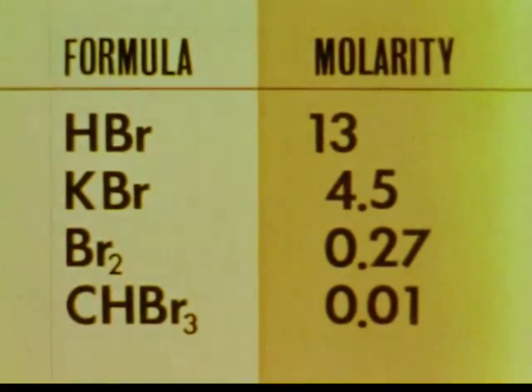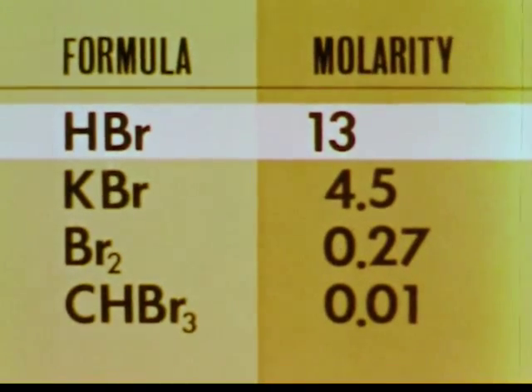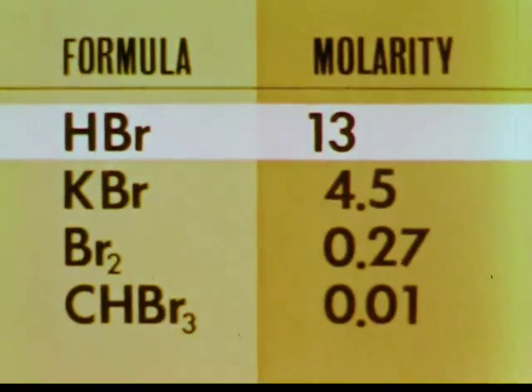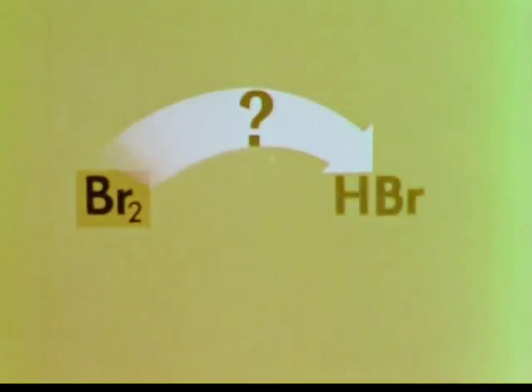compounds in water. We note that hydrogen bromide is highly soluble, confirming our earlier experimental observation. Thus, a large amount of bromine can be present in water as hydrogen bromide. But how can we convert bromine to hydrogen bromide?